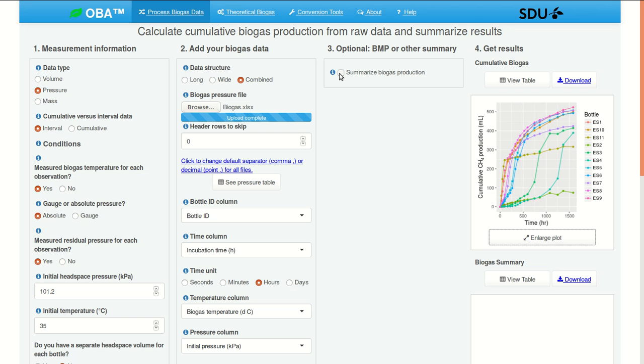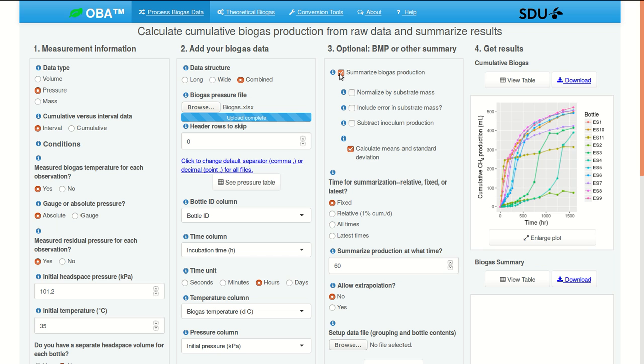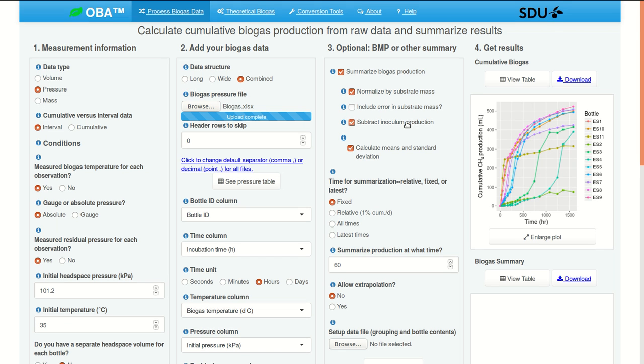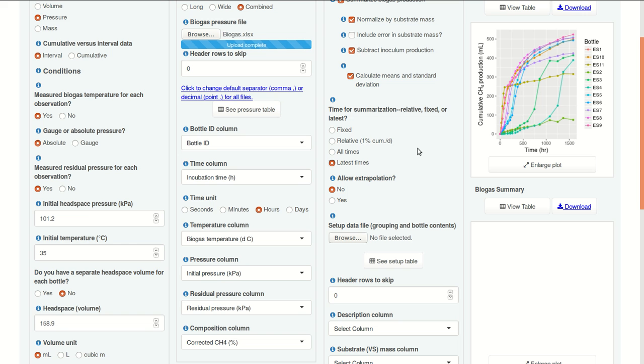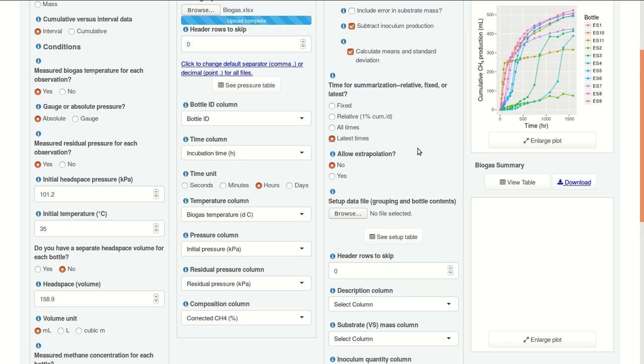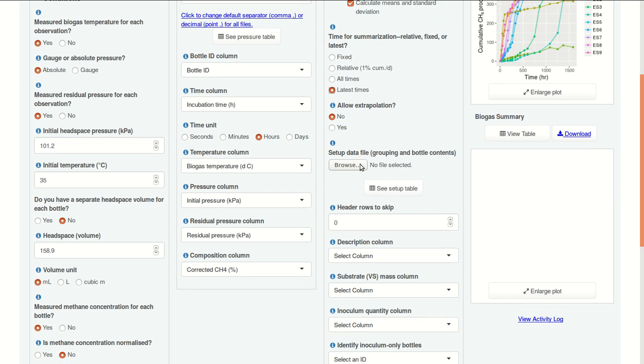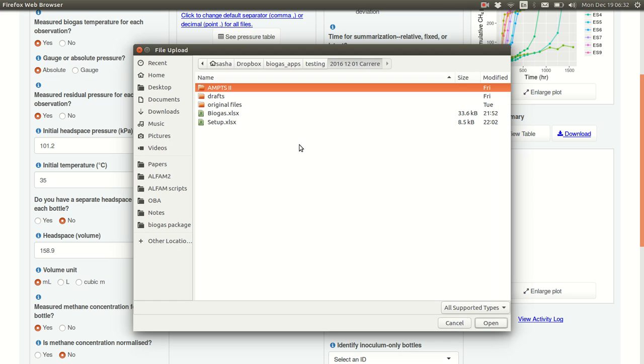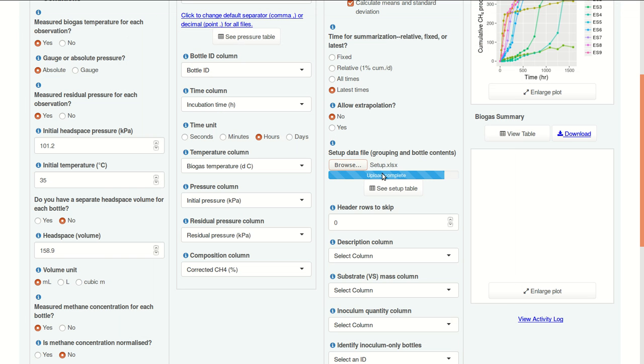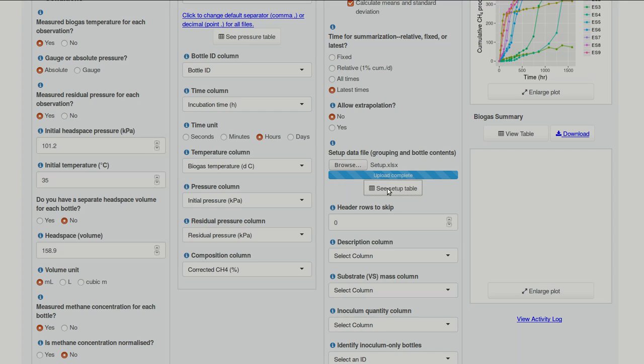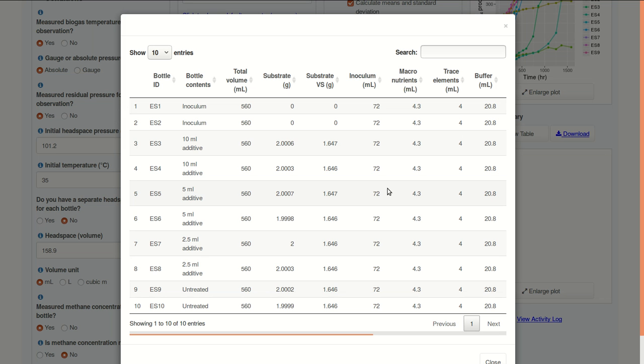So we're going to summarize biogas production. We want to normalize by substrate mass, and we want to subtract the inoculum contribution to methane production. For the time, this is the time at which we'll evaluate BMP, we're going to use the latest times for now. We don't need to extrapolate. Let's browse to this file, and let's take a look.